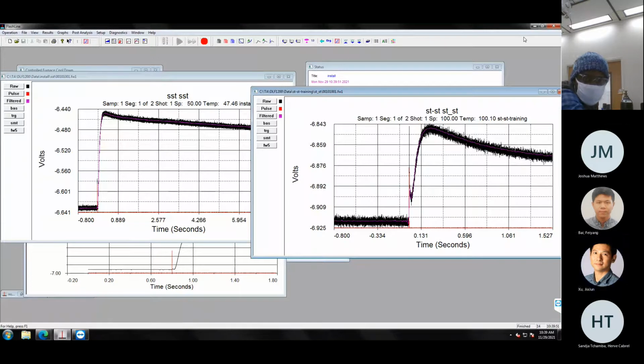Yep. So we understand we don't have the sample holder for the liquid samples. Let's say if we get those, we can directly load them in the same procedure as for the solid sample. I've only seen the liquid sample holder one time, and to my knowledge, it's a capsule, right, where you load the liquid in, but the same rules apply.